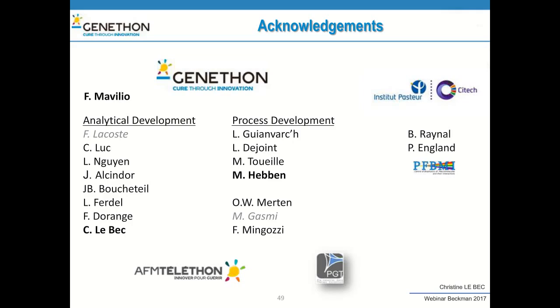We didn't see any difference. But some authors also use this technology as a stability indicator, and it shows some different forms at 37 degrees.